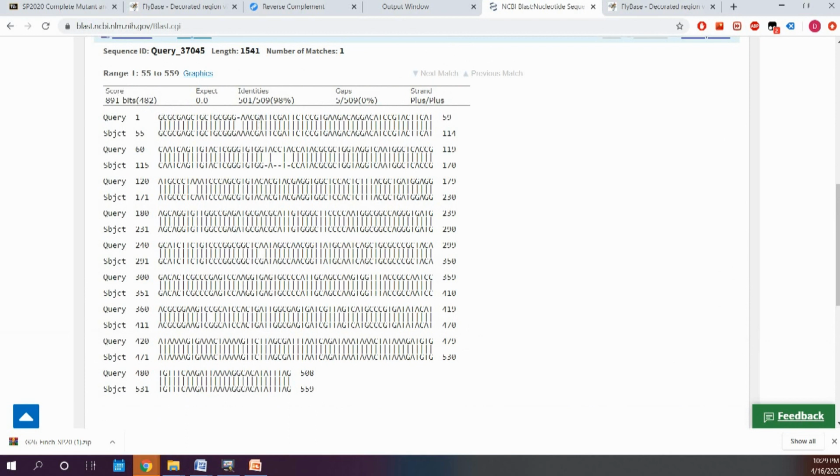So what we want to do with these sequences is validate them in the chromatogram and make sure that these are actual good reads, these insertions, deletions and SNPs, and not just an artifact of the sequencing. When you do the sequencing, there's a possibility that the sequencing was just not clean and you get missing nucleotides, or the peaks are overlapping and you're reading the wrong peak. So it could be just bad sequencing.